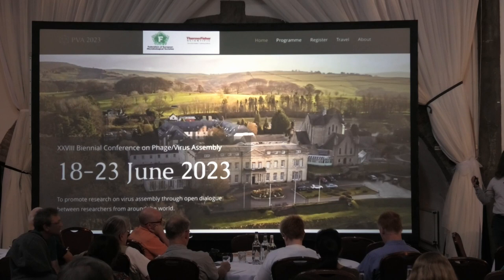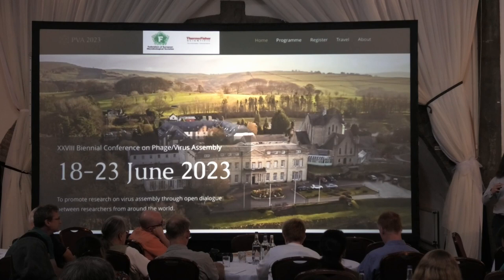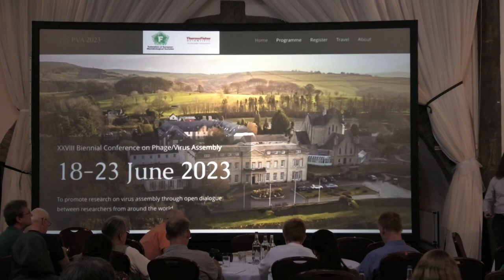Yeah, the hexons have matured there. So yeah, the portal does not touch any pentons. So it's away from them. So we don't really expect to see it, and we don't see anything that requires that. That was my point.